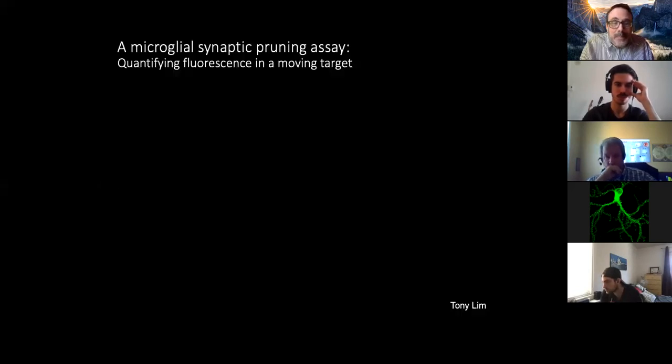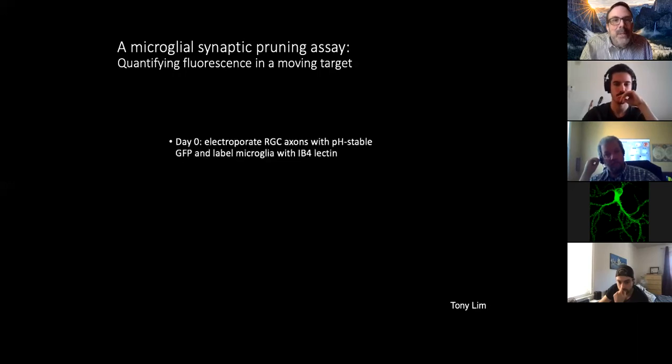So Tony expresses CD46 then in the axon, and he asks, what is that going to do to arborization and to microglial uptake of GFP? So how do you measure the uptake of GFP without sitting there at the microscope for 8 hours hoping to catch one of those lucky interactions? One thing is to just measure the amount of green fluorescence associated with microglia.